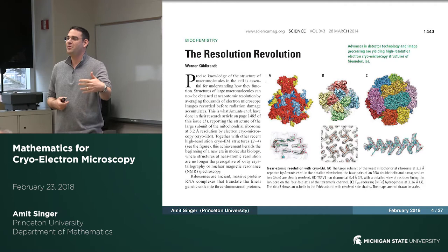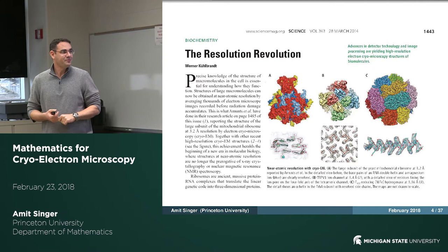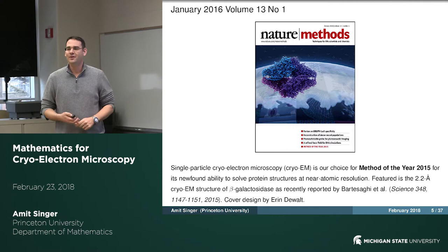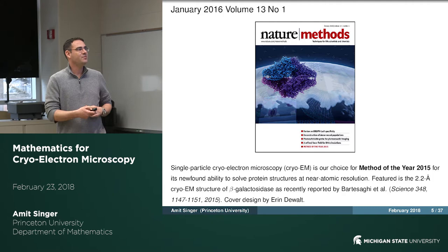2 angstrom resolution. And it was only in recent years, let's say in the last 5 years, that it actually fulfilled the promise by switching to different detectors. The new detector is what allowed this revolution and this Nobel Prize this year. Again, just another testimony to the realization of what cryo-EM can do. Nature Methods selects a method of the year every year, and cryo-EM was selected as method of the year 2015 for its newfound ability to solve protein structures at near atomic resolution.